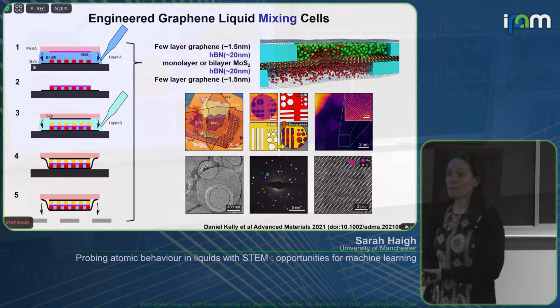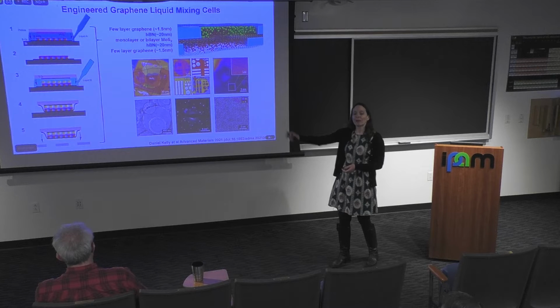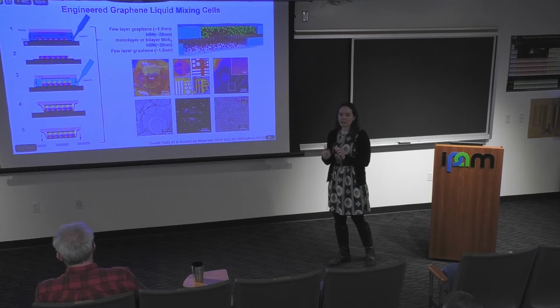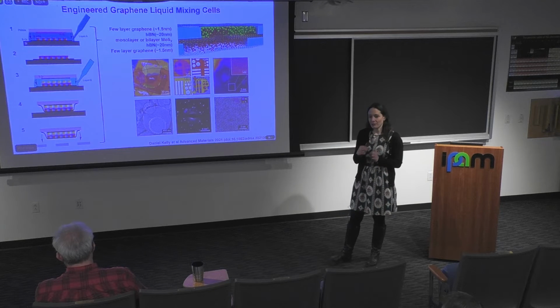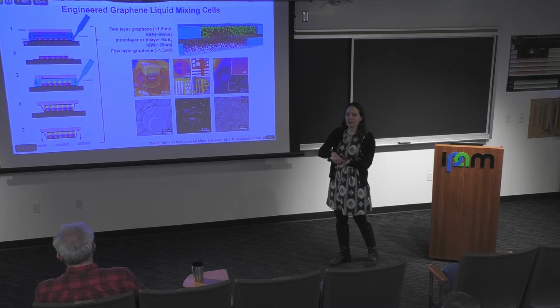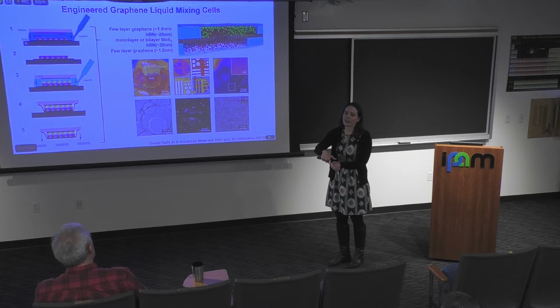And so we can go for the same approach here, is that we have one graphene liquid cell before, and now we're going to just put another one on top. We're using this stacking approach. All of this is done using single crystals, which are mechanically exfoliated. That's using Scotch tape and pencils. You peel them layer by layer. You use a micro manipulator and you stick them back down together. Only in our case, we stick them back down in the presence of a liquid.